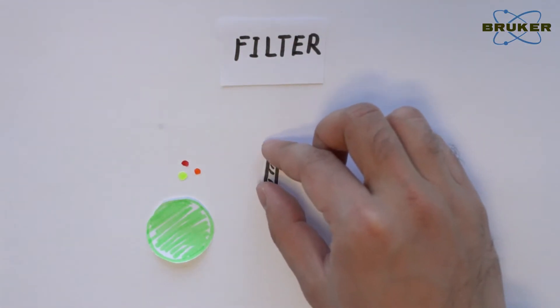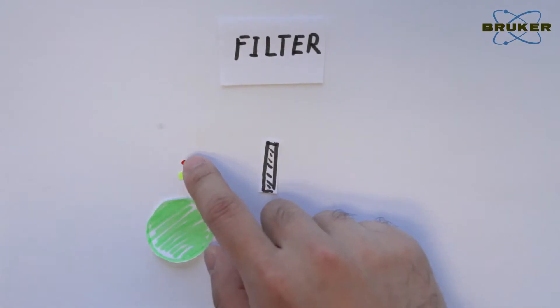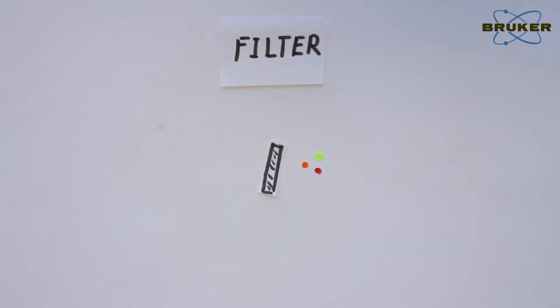The next key part is the optical filter. This filter only allows Raman scattered light to pass through, and reflects Rayleigh scattered light, whose wavelength has not been changed.